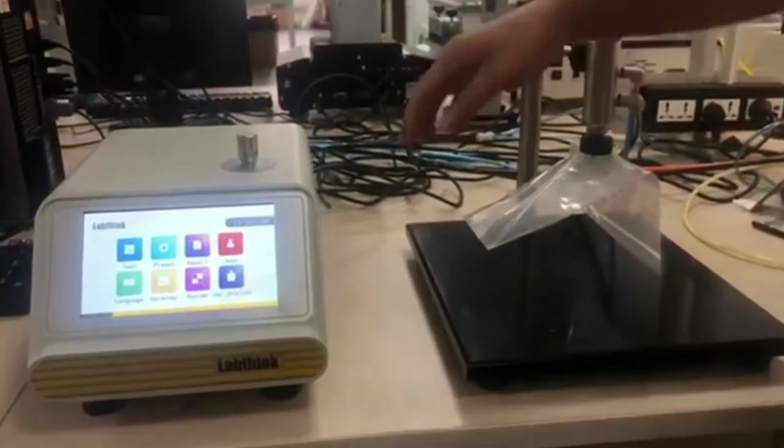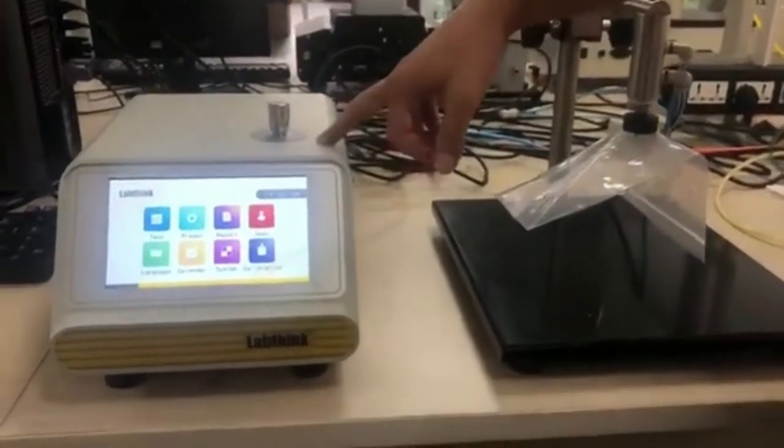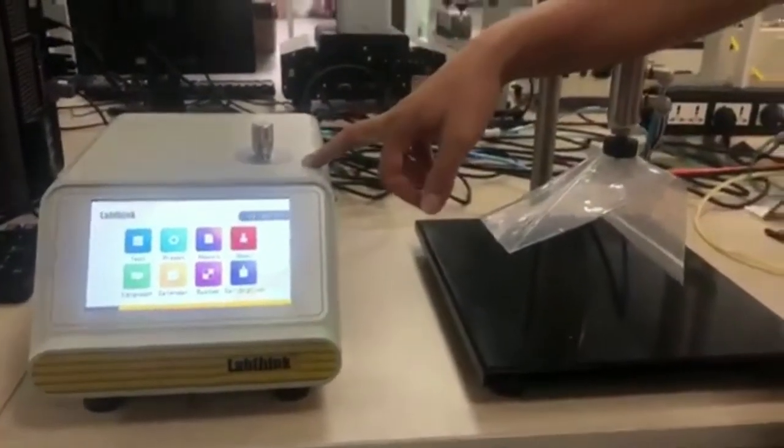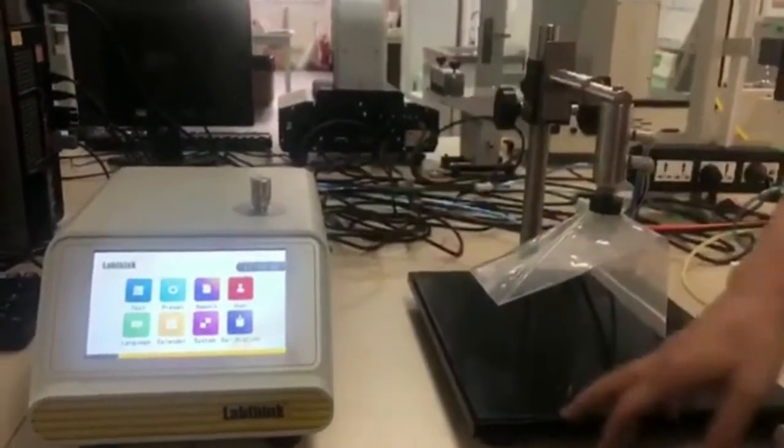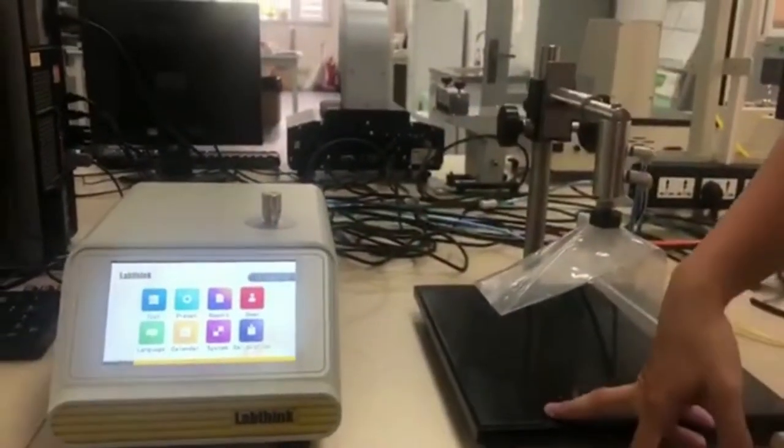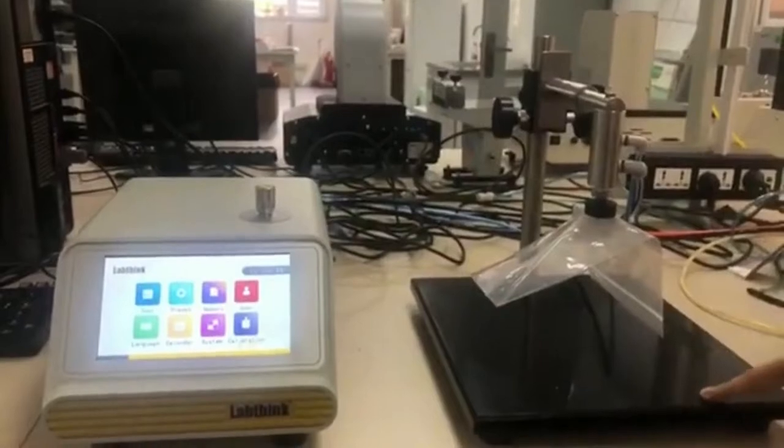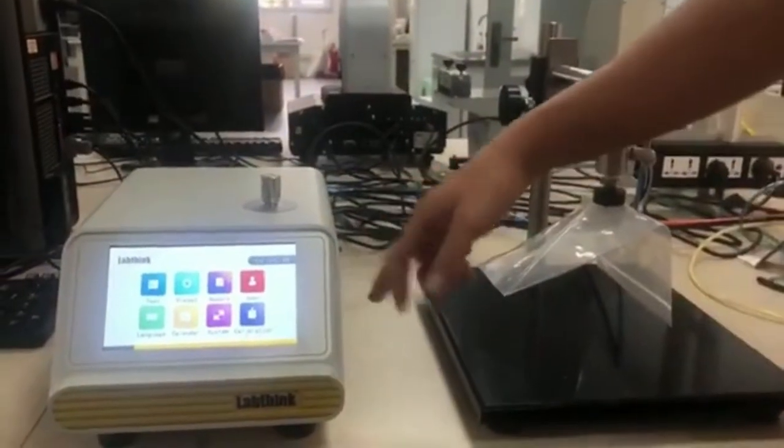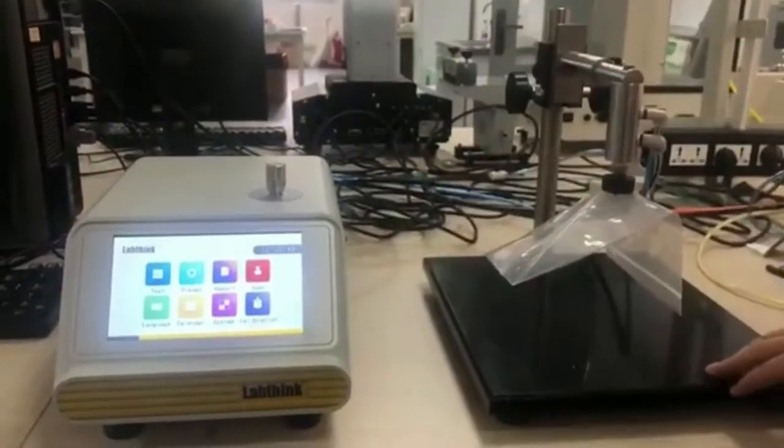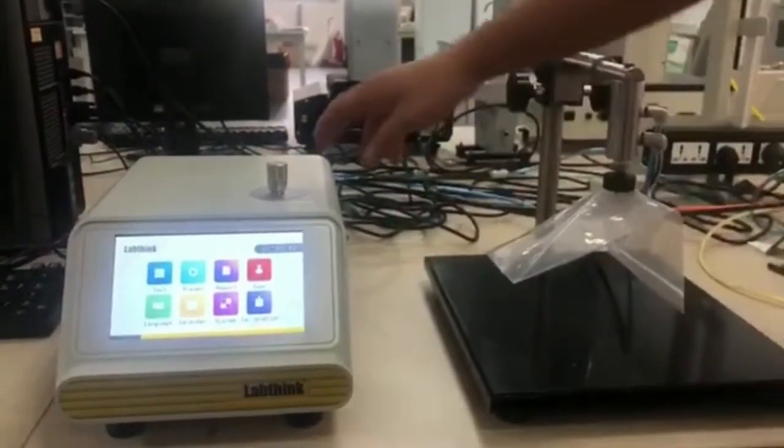Hey there, this is the burst and project decay tester from LabThink. It consists of two parts.